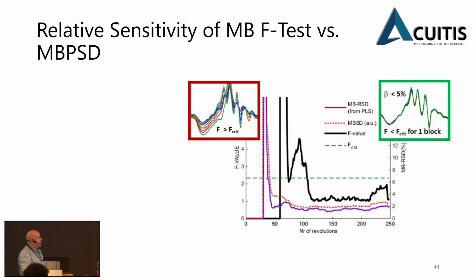It's from 2016. But you can see here clearly where the F value is detecting much more sensitively the changes in this part at the end, which is the lubrication step in the blend, compared to what's detected by the moving block standard deviation test itself.